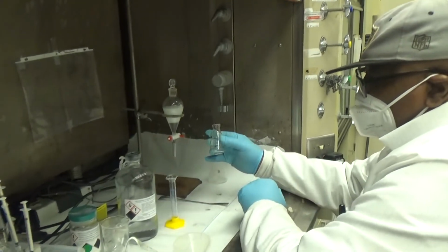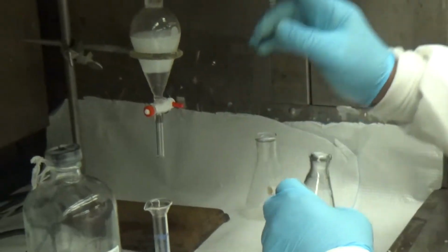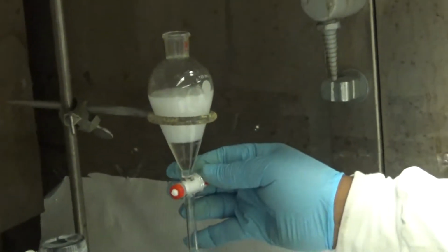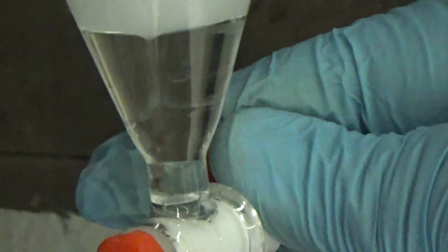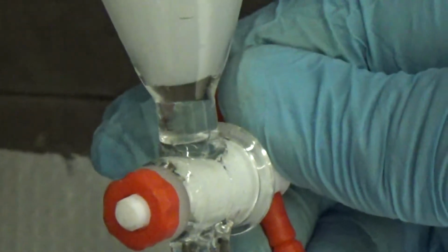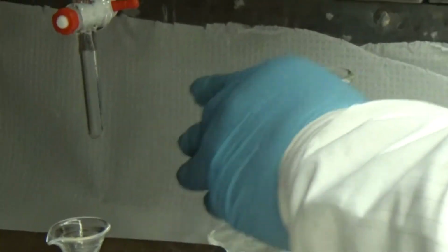Now I am going to do a first extraction. It's very important that when you extract, you need to turn the top and extract, draining out the bottom into a flask. Okay, stop. That's the first extraction. So there's your product in the dichloromethane from the first extraction.